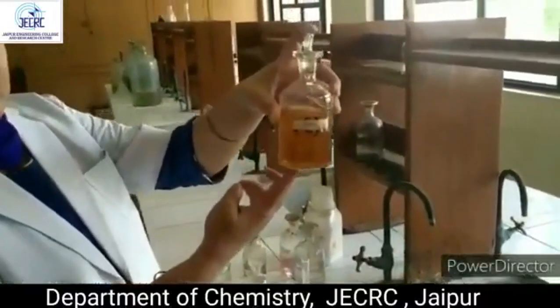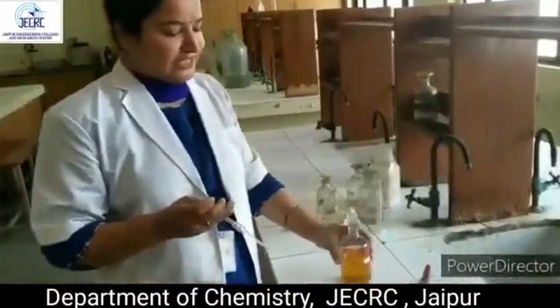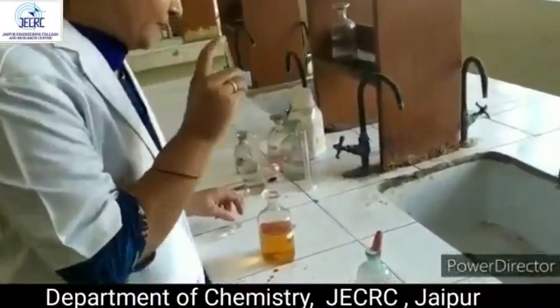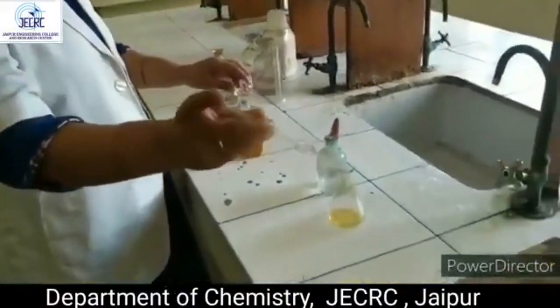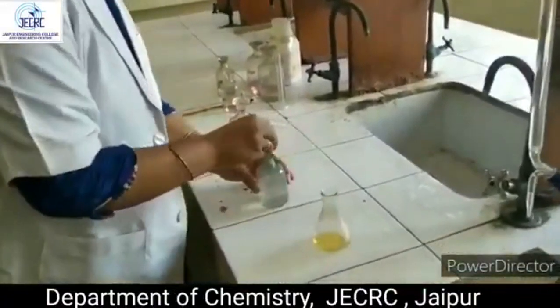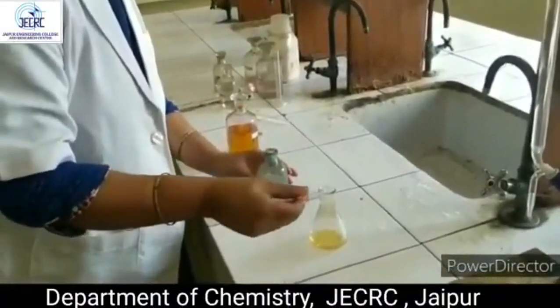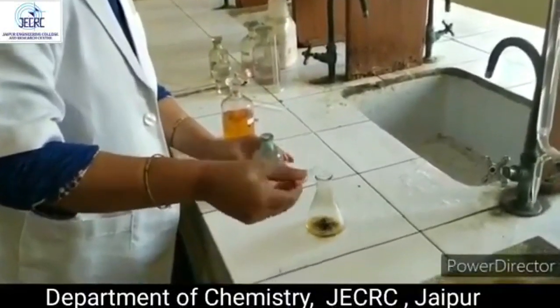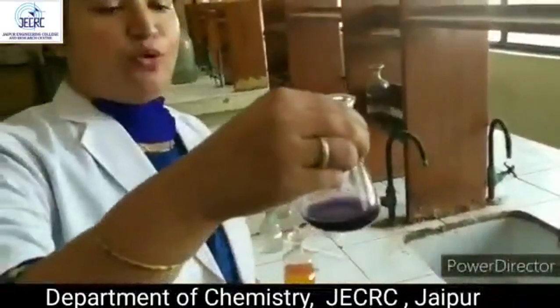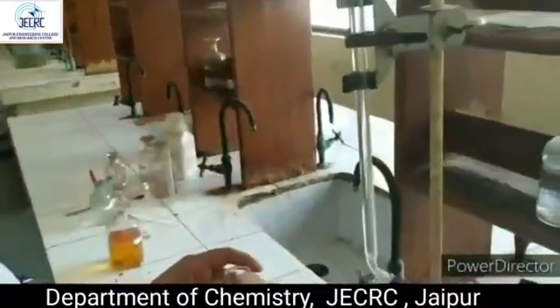Now see, the clear solution appears. From this clear solution, we'll take 10 ml of solution. Now 10 ml of solution is taken in the conical flask, and 2 drops of indicator. Here we are adding the starch. So blue color appears. This blue color is because of the iodo-starch complex, as the reaction is iodometric.